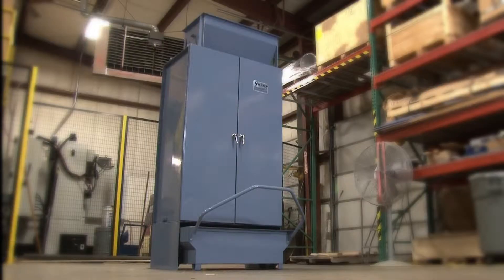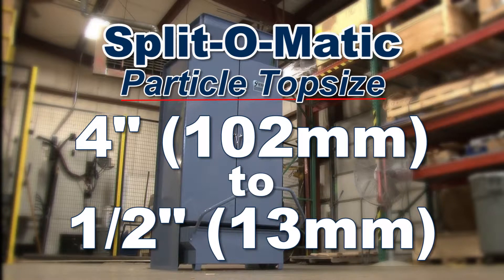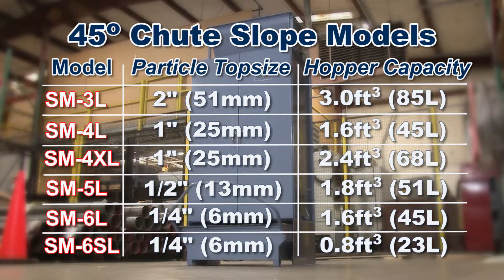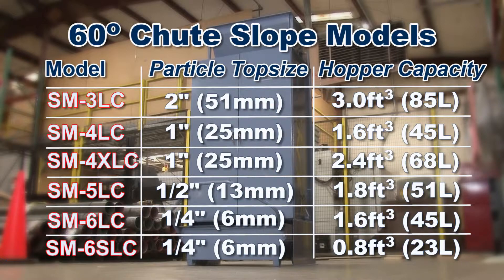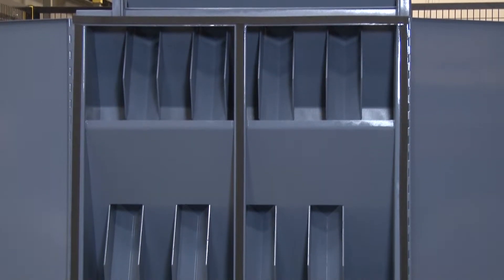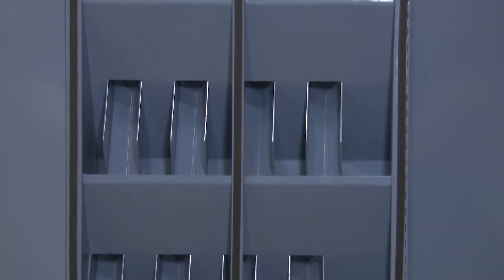With a recommended particle top size range from four inches to one-half inches, Gilson offers multiple Split-O-Matic splitter models to choose from. Standard models are designed with 45-degree chute slopes, but Gilson also offers models with 60-degree chute slopes, which are designed for low-specific gravity materials such as coal or coke, and materials with a large fraction of fines.